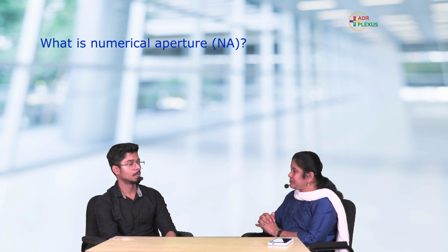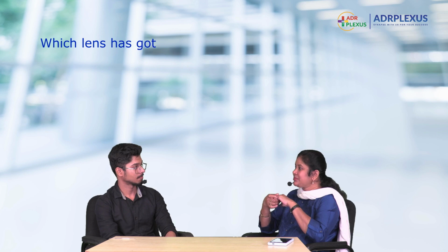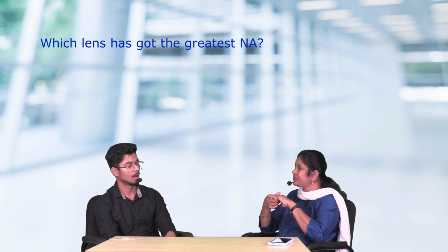Exactly. Very good. So, what is numerical aperture? Numerical aperture is the ratio of the diameter of the lens to its focal length, ma'am. Yes, and it is the index of resolution power. Now, if the numerical aperture is more, how will the resolution power be? It will be greater, ma'am. Which lens system has the greatest numerical aperture? Oil immersion. Excellent. Very good.